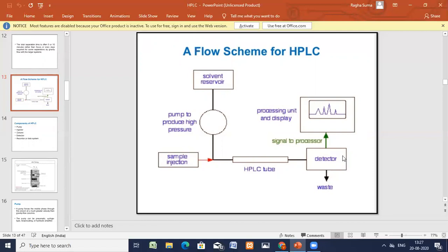So the pressure is needed. Since the columns are thin and long, good solvent compatibility is also needed. Pumps are also available which can provide high pressures. Heat generated when operating at high pressures is removed. The mobile phase system is introduced into the columns through reservoirs. These must contain a degassing system and be attached to remove dissolved gases.